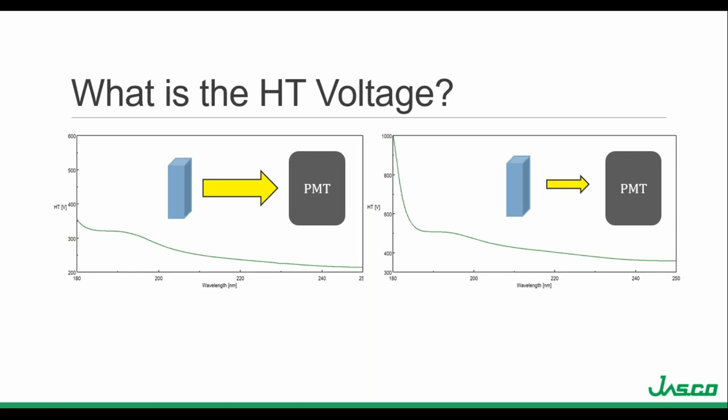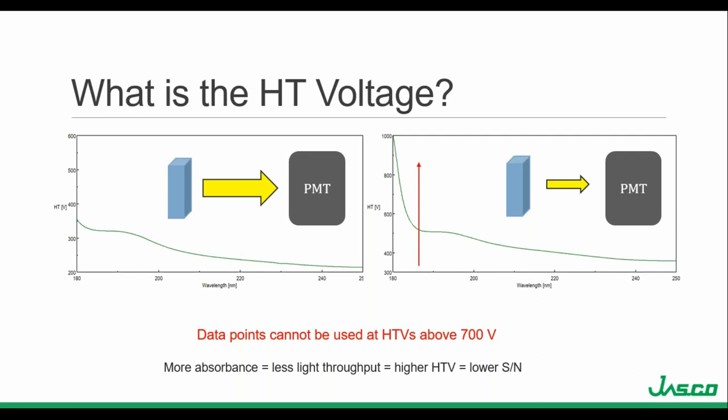However, if a sample absorbs too much light, not enough photons reach the detector and the signal needs to be amplified, increasing the HT voltage. If the HT voltage is equal to or above 700 volts, there are not enough photons being sampled by the photomultiplier tube detector to measure a reliable CD signal, and we can't use these data points. The more photons reaching the detector, the better the signal to noise. At higher HT voltages, while below 700 volts, the CD signal will start to look noisier. Additionally, the further into the far UV you go, the less light available, so the HT voltage increases at shorter wavelengths.